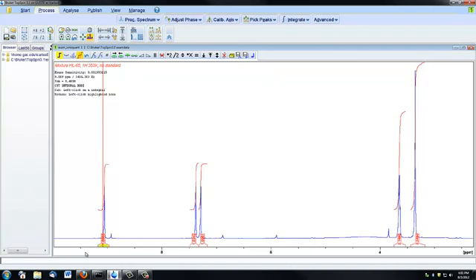So if I have this integral selected and then I click on this bias correction icon and click and drag up and down, you can see that the lines are changing, and same thing happens with the slope. So you can just mess around with those until you've got a nice integral shape, and you'll notice that the value actually changed when that happened, which is important because you're getting more accurate results if you actually do this. So if I move on to the next integral, I can do the same process again, just evening that out.